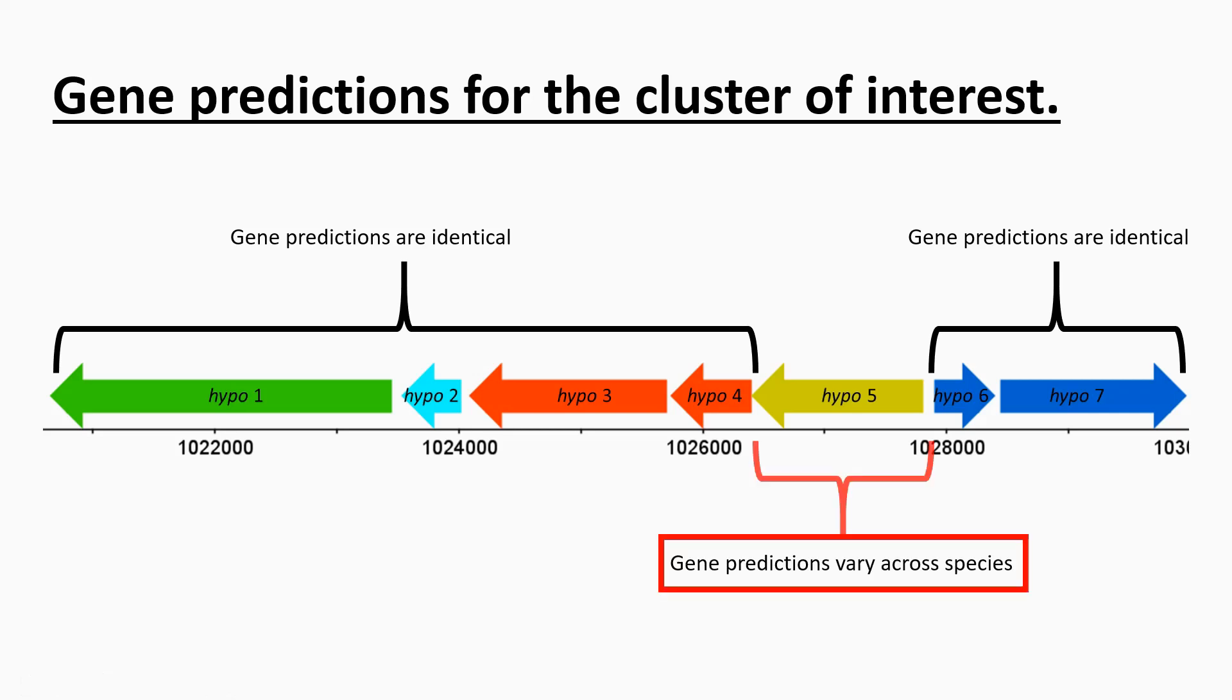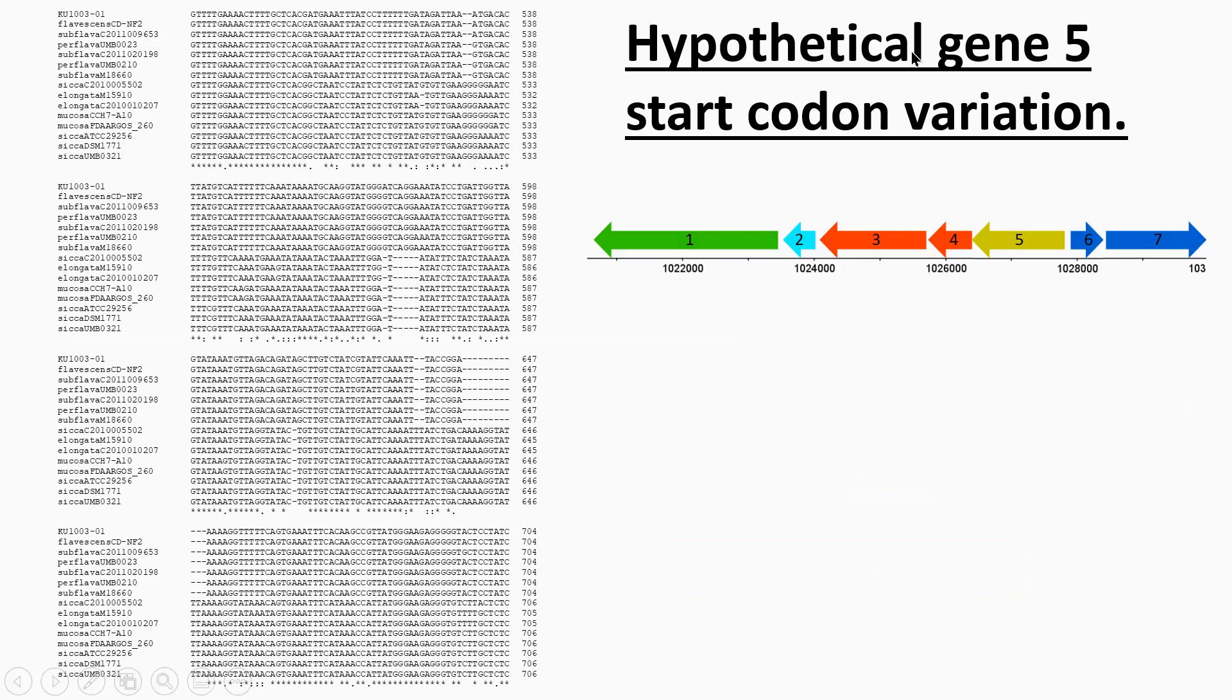So the only issue really as far as I can make out lies in the prediction of this gene here, hypothetical gene five. What I found was there was some variation in the start codon for this particular gene.